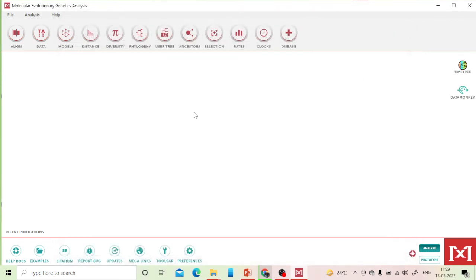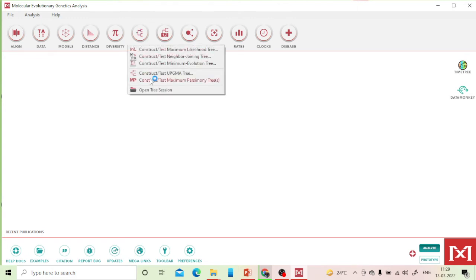Now you're all set to perform phylogenetic analysis. Go to the 'Phylogeny' menu. I'll demonstrate maximum parsimony, but the steps are the same for UPGMA, neighbor-joining, or maximum likelihood. Click on 'Construct Maximum Parsimony Tree'. The first requirement — multiple sequence alignment — is already done.